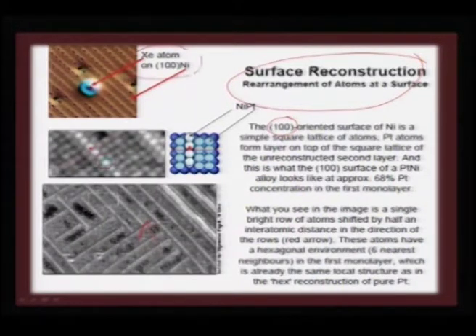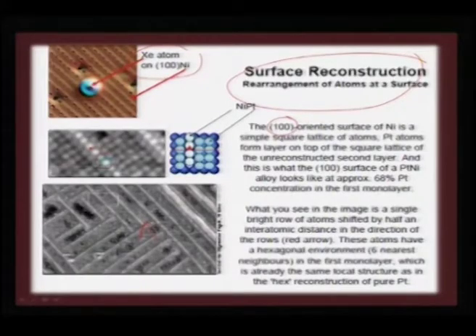It is also possible to map some adsorbed atoms on nickel. This is one good picture which shows how xenon can be adsorbed onto nickel 100 at very low temperatures. It is very difficult to deposit xenon, but when the substrate is cooled to a very low temperature, it is possible to trap xenon atoms. So, this sort of mapping can also be done, and you can also see that on the nickel 100 surface there are some defects which can also be tracked.